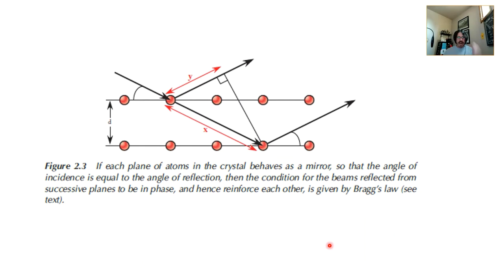If you look at diffraction now, the Laue equations are very complex. You have three equations to try to piece everything together. Bragg's law is far more elegant. We'll talk a little bit more about that today. You look here, you have the beam diffracting on this row of atoms versus the beam diffracting on this row of atoms. The crystallographic planes are essentially a mirror. If you're at the right so-called Bragg condition, you will achieve diffraction. If this incident beam is at the correct angle theta, you will achieve diffraction, and this angle is the so-called Bragg angle.